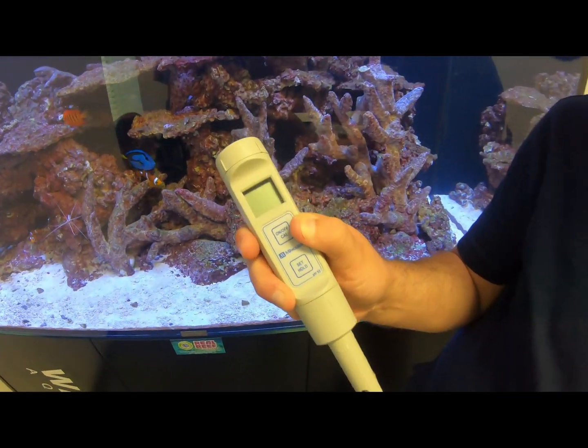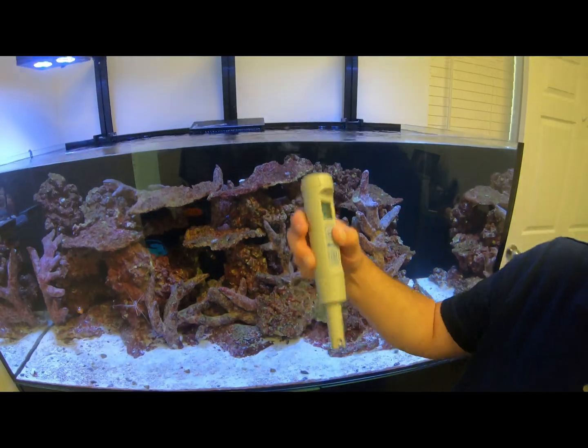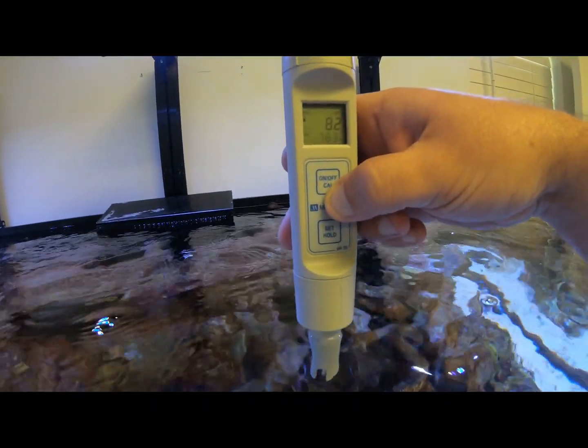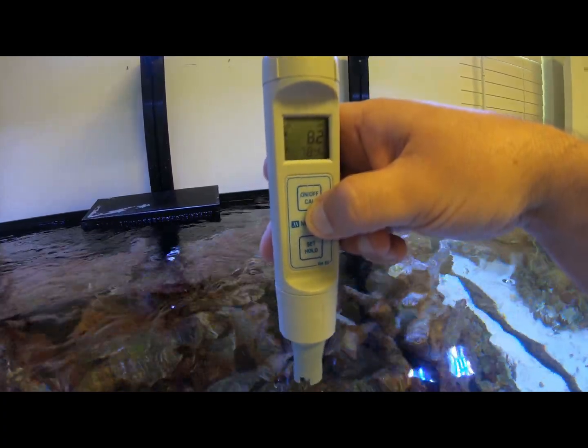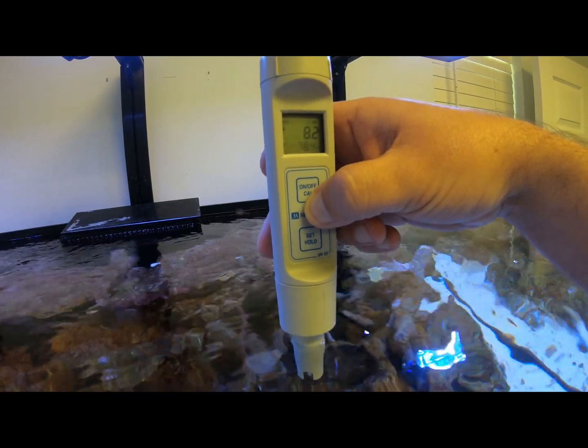I'm going to take the cap off the unit and push the on button. And it's reading 8.2, temperature 78.4 degrees Fahrenheit — right where it needs to be.